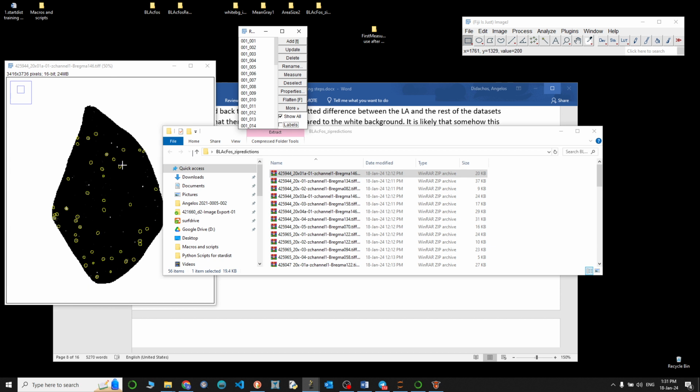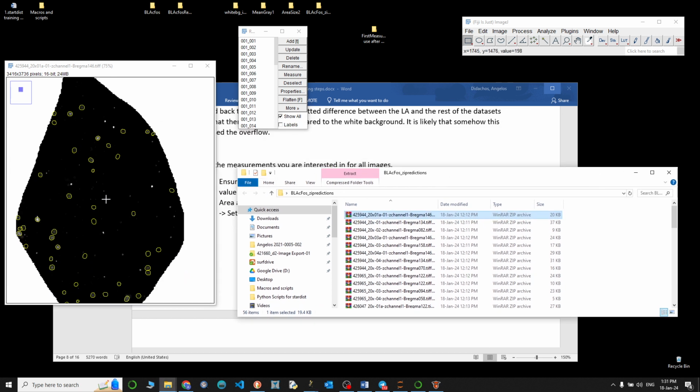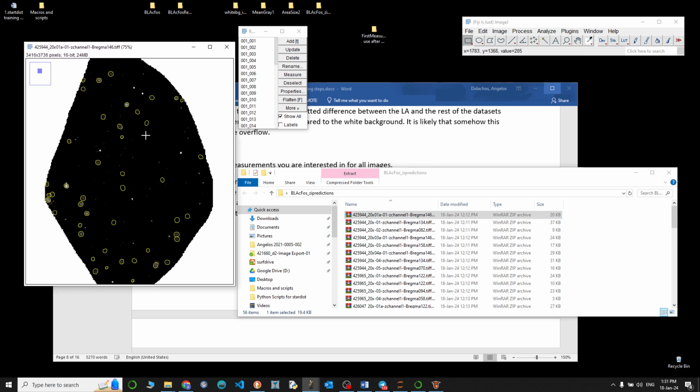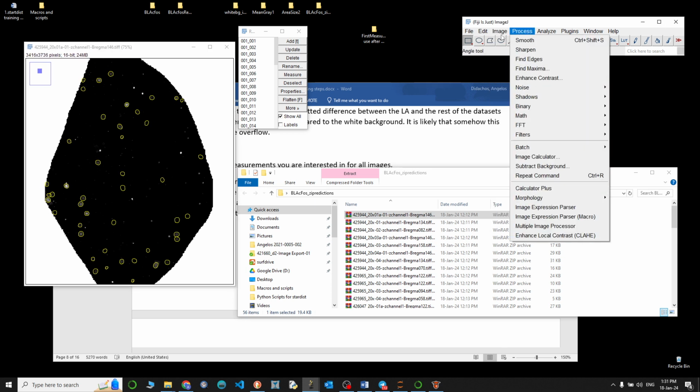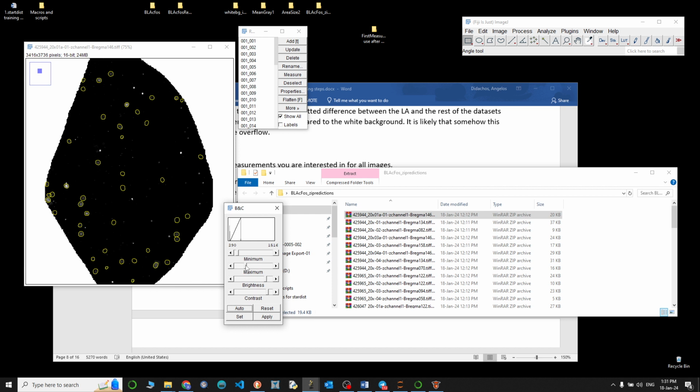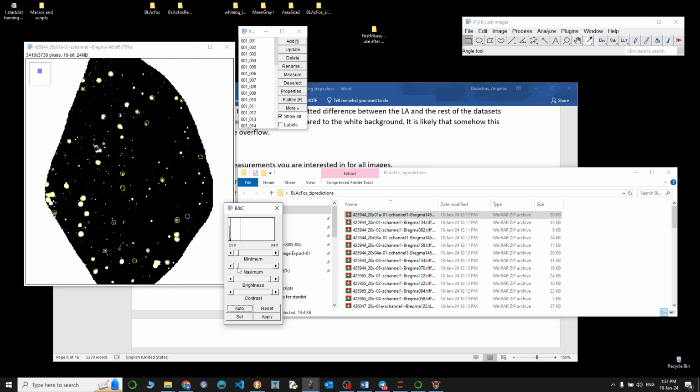And now you can see your predictions here. In this case it's not ideal because the mean gray value makes many images kind of lost, but that's why we said that we always take the mean gray value as a reference point, but we always have the freedom to change a bit and see how well the predictions work if we tweak the brightness a bit.